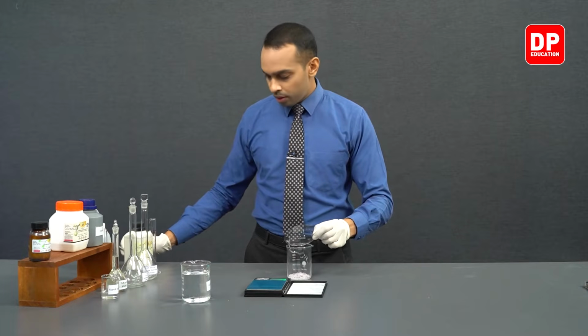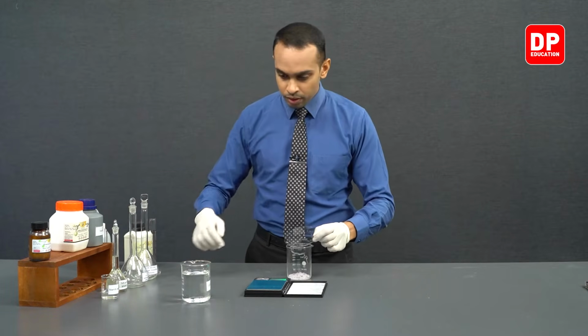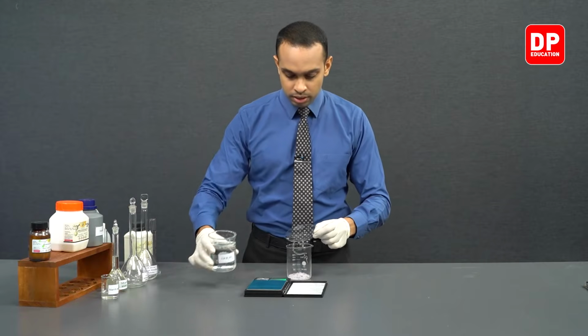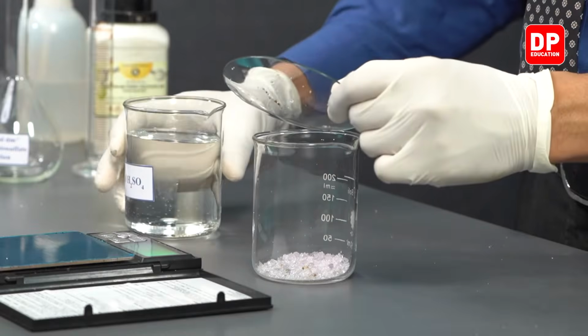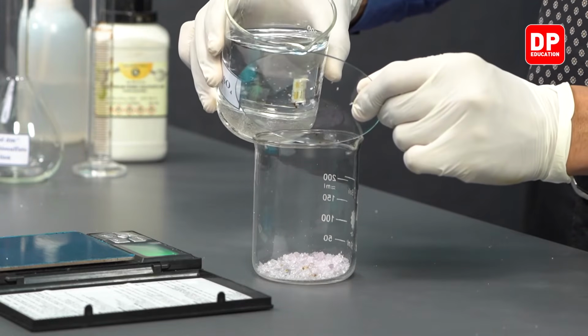And then we can proceed to wash the watch glass with some sulfuric acid.